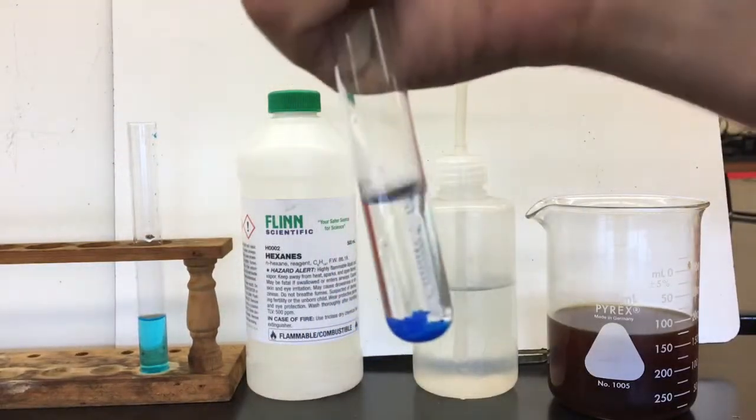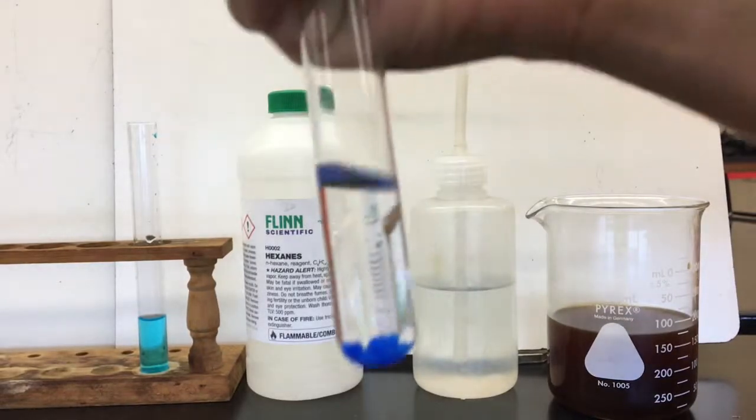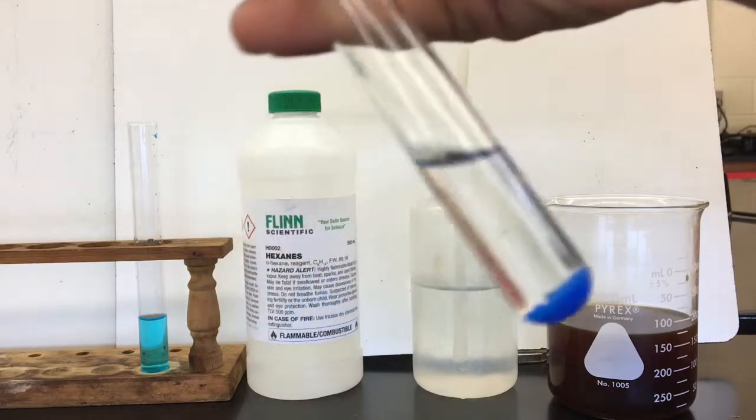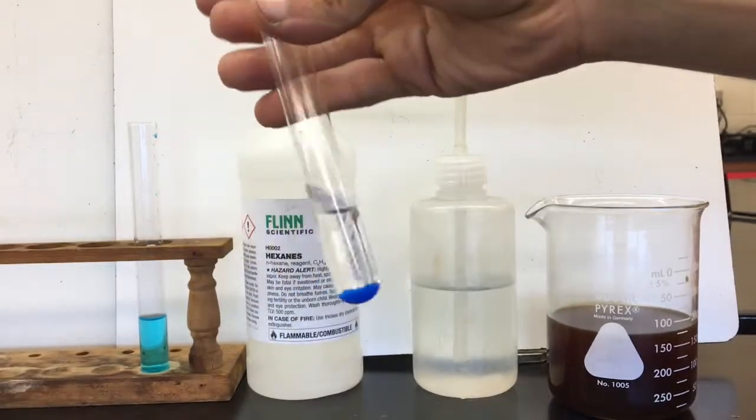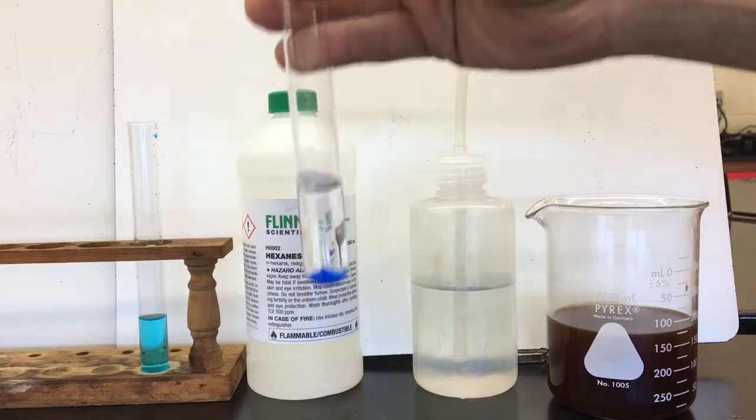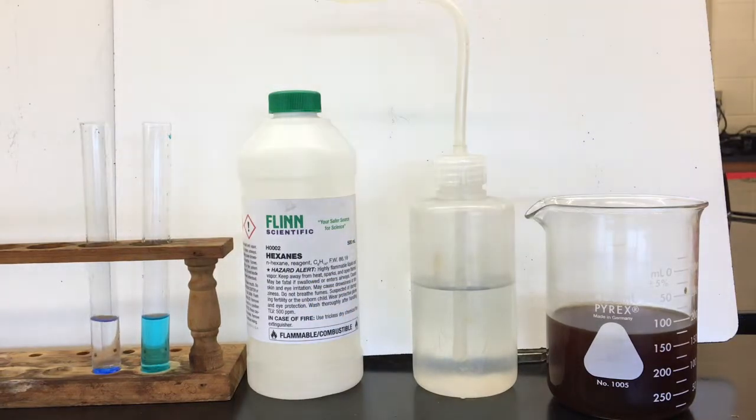Doesn't seem to be dissolving at all. The hexane is not dissolving this copper nitrate. The copper nitrate is just sitting there at the bottom of the test tube. Like a butt face. When I swish it around, it just settles back down. Interesting stuff.